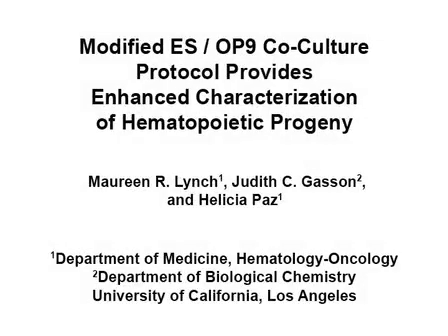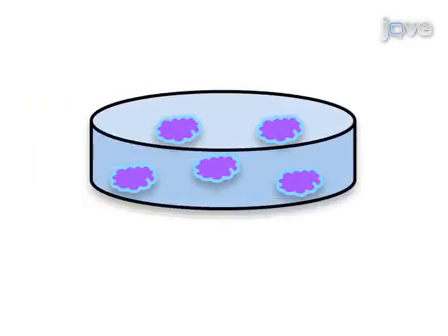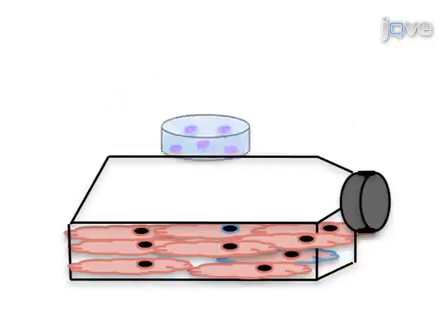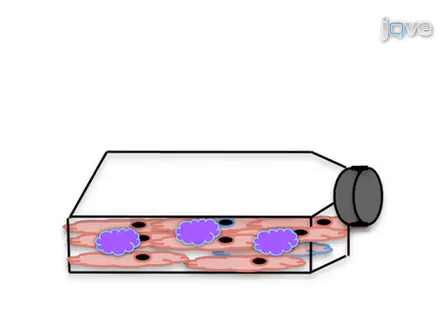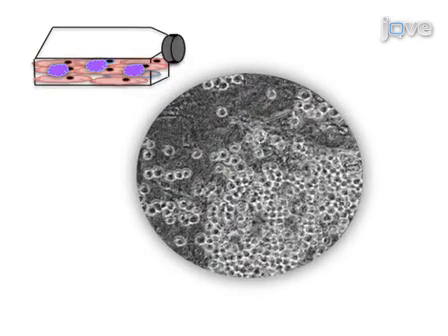The overall goal of the following experiment is to differentiate murine embryonic stem cells into various primitive and definitive hematopoietic lineages and to characterize all ES progeny. Murine hematopoietic cell differentiation is achieved by placing ES cells onto a confluent, fluorescently labeled M-strawberry OP9 stromal cell layer. Each day of differentiation or co-culture represents the various stages of hematopoietic development.